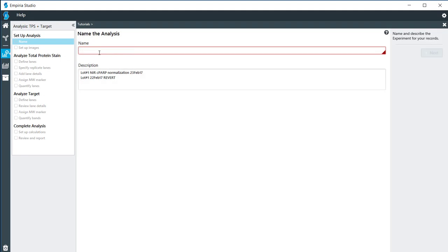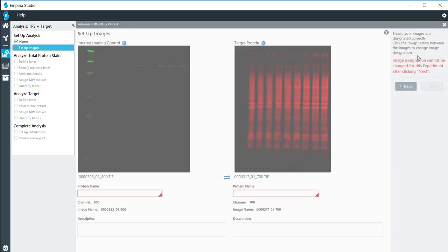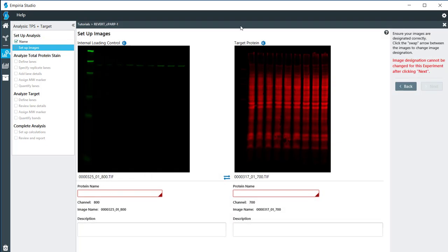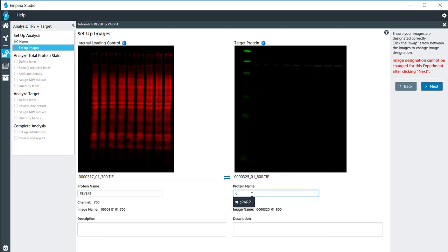For this experiment, I have Revert as my normalization and I have CPARP as my target. Now, these were pulled in in the opposite of what they needed to be, so I'm going to switch this so that I have my internal loading control as my Revert and my protein is CPARP. Once we have those named, I'm going to click on Next.